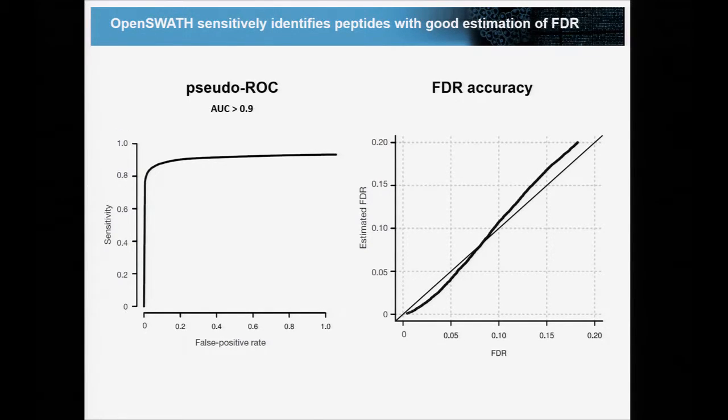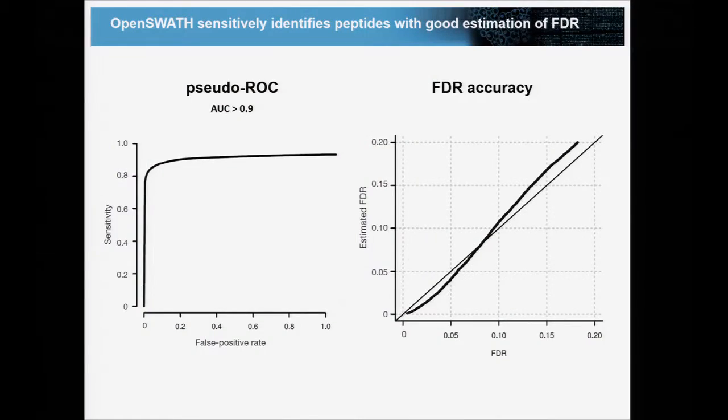And in fact, in the manual analysis, the peak groups were somewhat over-annotated, we think. As you go down the dilution curve, it's always very easy to annotate the same peak every time. So this missing 5 or 10% might not be findable in a real manual inspection, but because it was a dilution series, it was easy to find these peaks. So even this is a little bit unfair against the software. But the point is that we can recover the signal about 90% of the time.